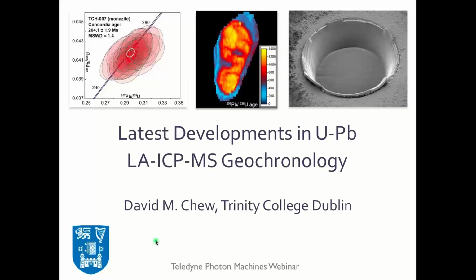So what I'm going to talk to you about today is the latest developments in uranium-lead LA-ICP-MS geochronology. Many of the slides and many of the things I'll be talking about have been developed in our own lab in Dublin, but these techniques are also independently being developed in many labs around the world. So let's have a look at a brief introduction to how LA-ICP-MS works and how uranium-lead geochronology works before I show you some of the latest developments.